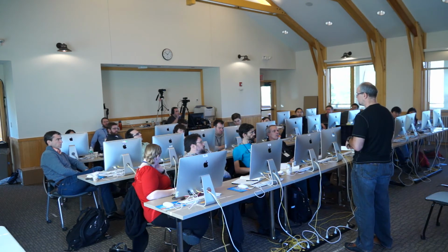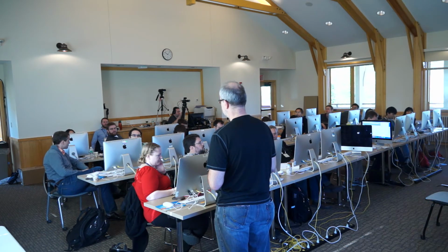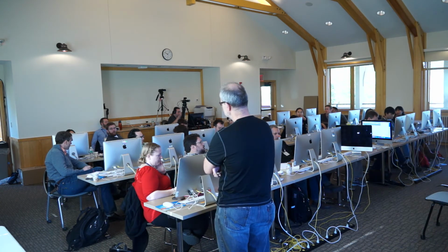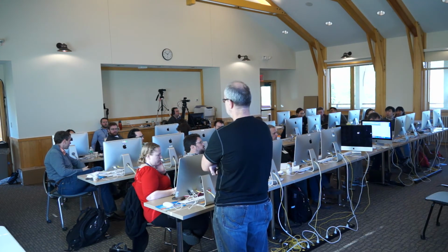That's the idea. Do you find things mapping to triplet repeat regions like Fragile X, or can you find that? Well, it's one of those things like, if you have largely duplicated genes and there's a variant in one of them, we sometimes don't know which one it is. But sometimes if you just know that there's a difference in that stretch, then you can go back and figure out exactly what.